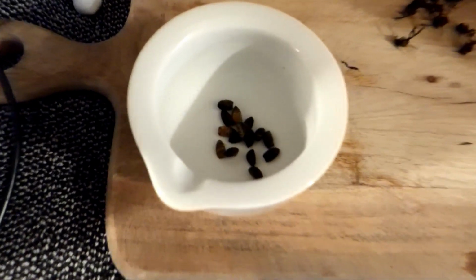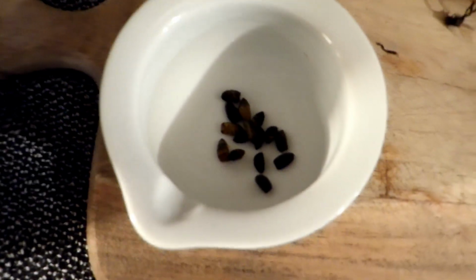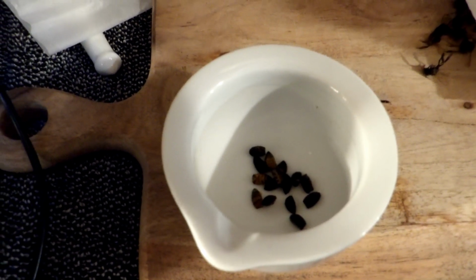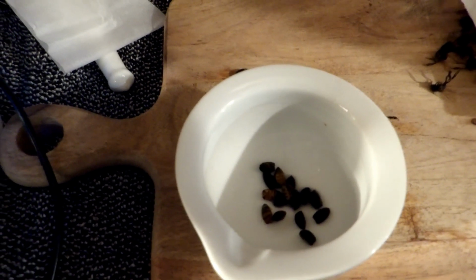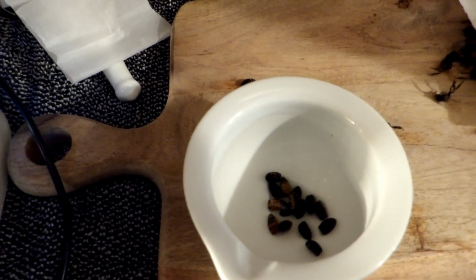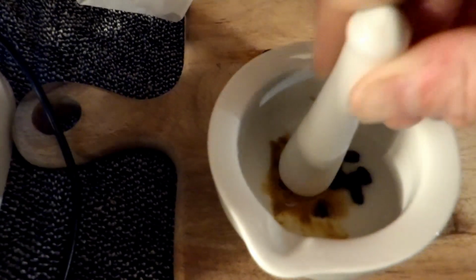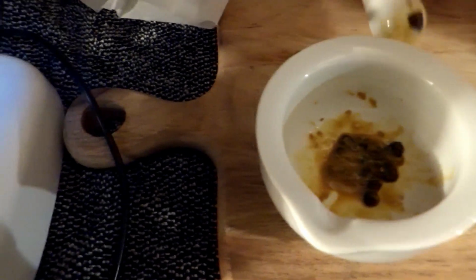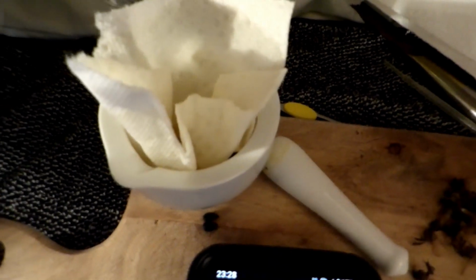So I got my 15 bees, and I removed the abdomens actually. Okay, and then once I do this, you gotta crush it up really good. Crush all the abdomens up good. You can see there's a lot of poop in there still, so they're not all pooping in there. So Mike got the bees cut apart, and we smashed them and added 5 milliliters of water.